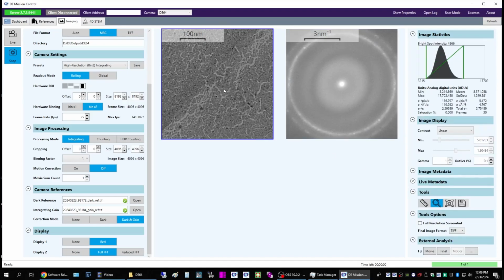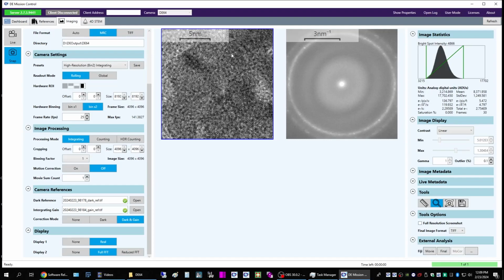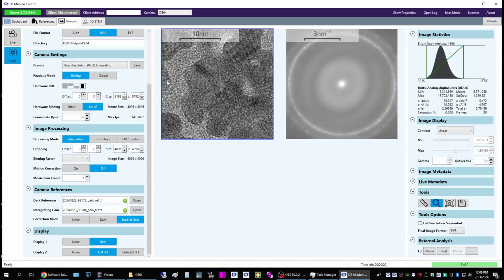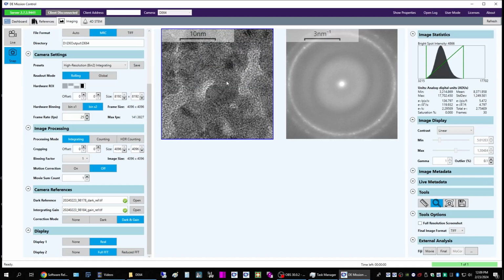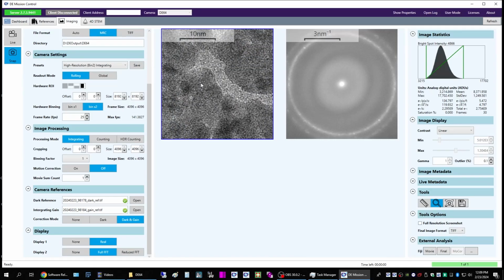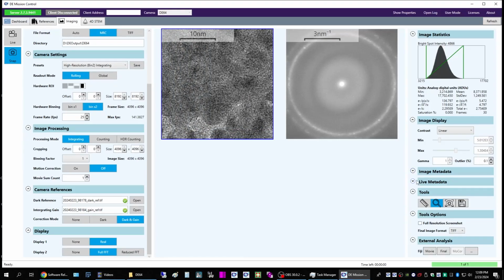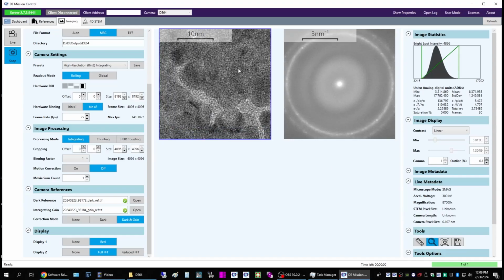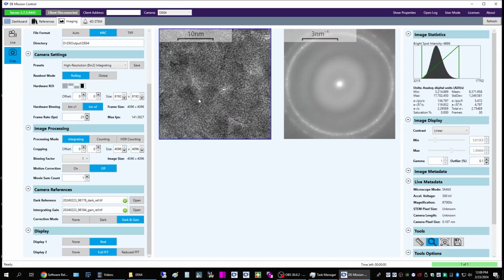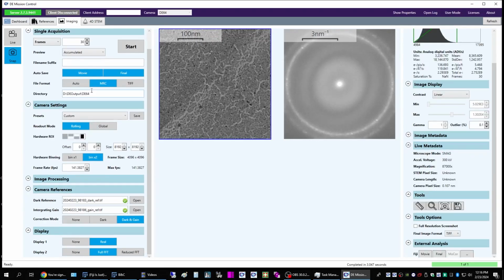Yeah, you can also zoom in if you want. Actually, see, there's our lattice images. So the nice thing about being at 4K is you really do have quite a lot of pixels. So we could do 8K here. We're only at, where are we? We're at 87,000 x, and yeah, you can see the quality of the images. It's quite nice.